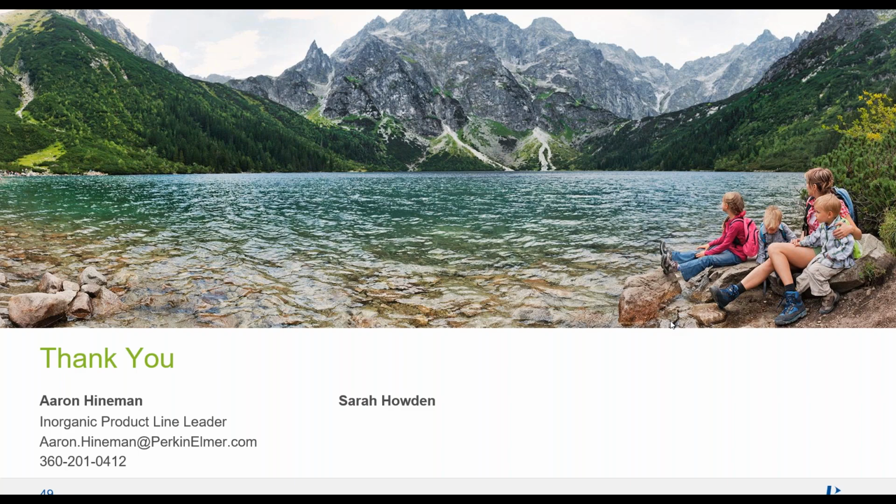So it doesn't matter too much, right? From my experience, I remember it didn't matter too much, but I guess for more complex samples, higher TDS, something like that could have an effect.